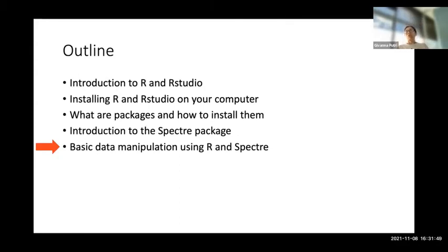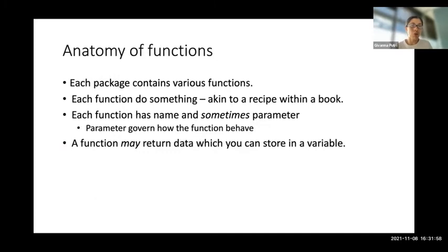Next, I'll be going through some basic data manipulations in R with Spectre. This will be predominantly a demonstration that I'll perform later. But before I get to that, I'll briefly explain the anatomy of a function.